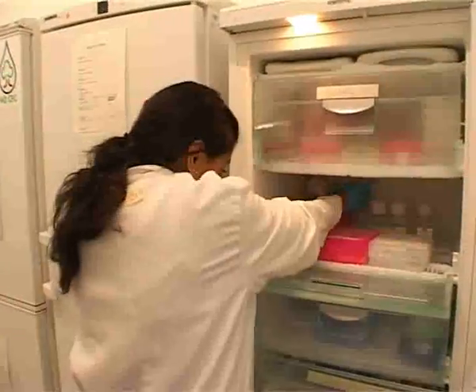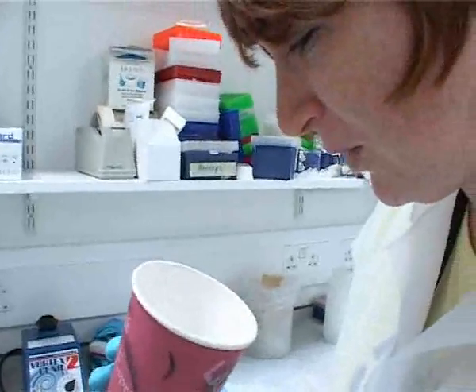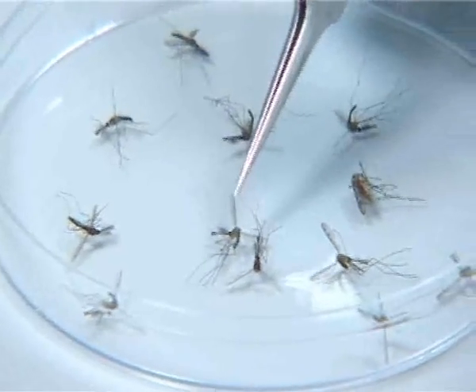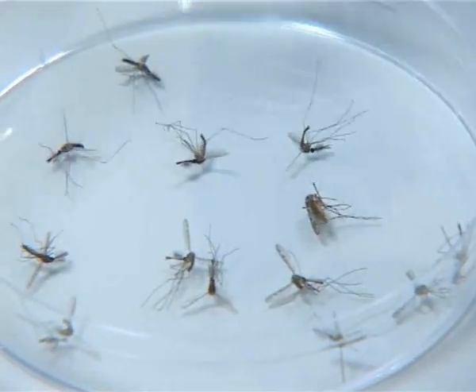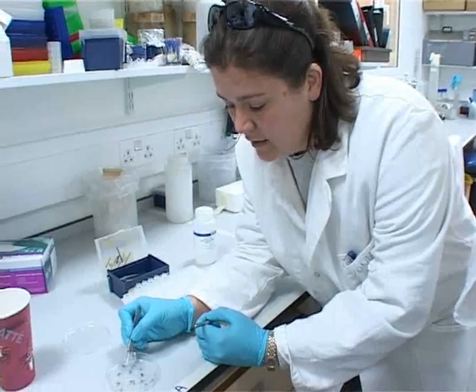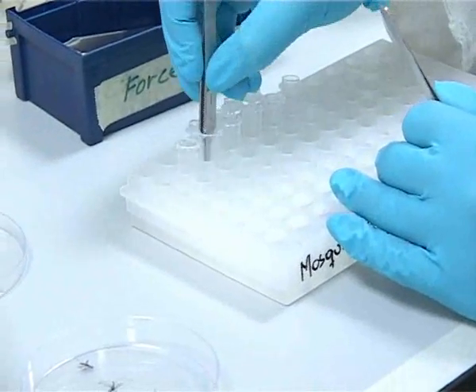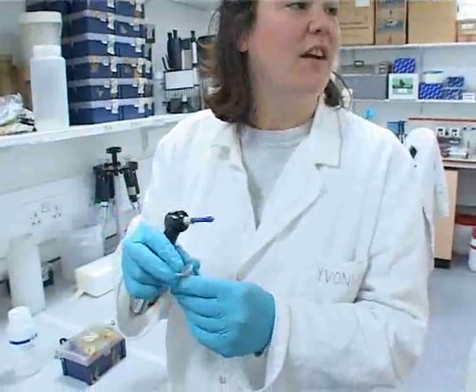And here they are. It looks like we've got quite a good haul from the ones we collected today. There are even some quite large specimens in here. These are Anopheles mosquitoes with spotted wings, but there are three different species here in the UK. So we can't actually tell any more about them just by looking down the microscope. So we look for these Anopheles mosquitoes with spotted wings and then we always do DNA analysis on them. Basically we just take the mosquito and pop it directly into these tubes here.